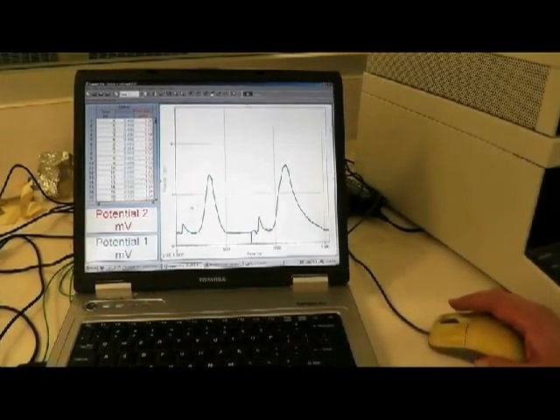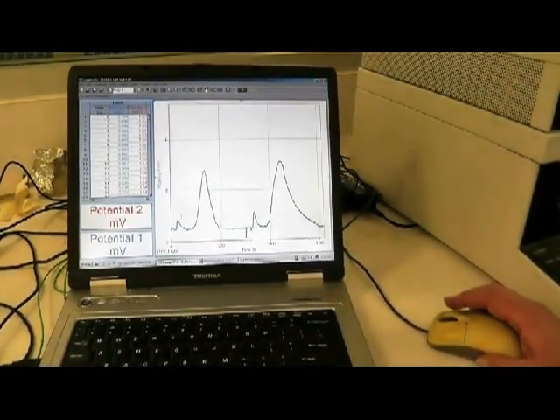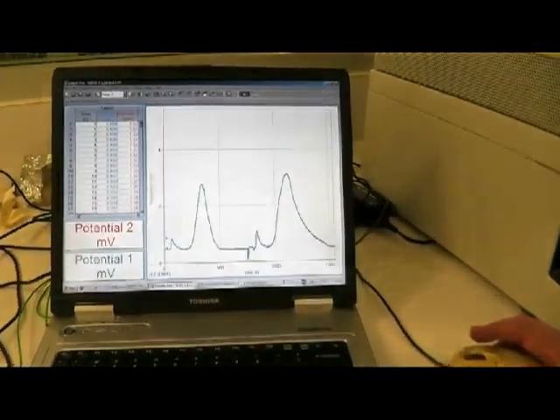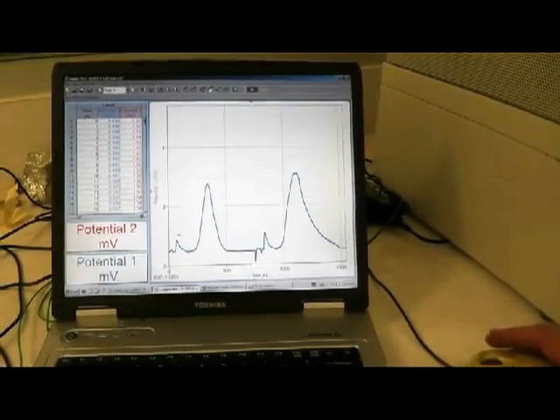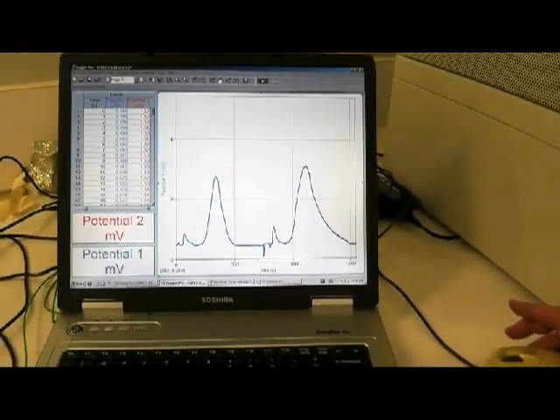Here we have a typical output from core, 50 centimeter core, where we see a signal from atmospheric nitrogen during sample loading. And then we have the signal that's related to the carbon.